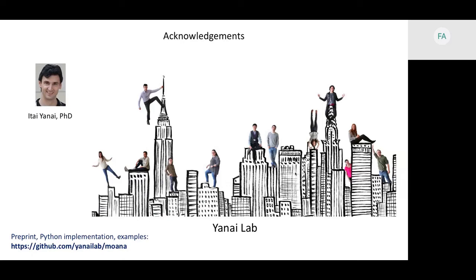So my question also for the smoothing, how do you choose K, actually? Yeah, so it depends. We're actually using smoothing in two different roles in this framework. One, we're using it for clustering, and then we're also using it for classification. For clustering, we're smoothing really aggressively sometimes, because that really helps us to much more easily define these clusters, and we're basically forcing cells to be in separate clusters.